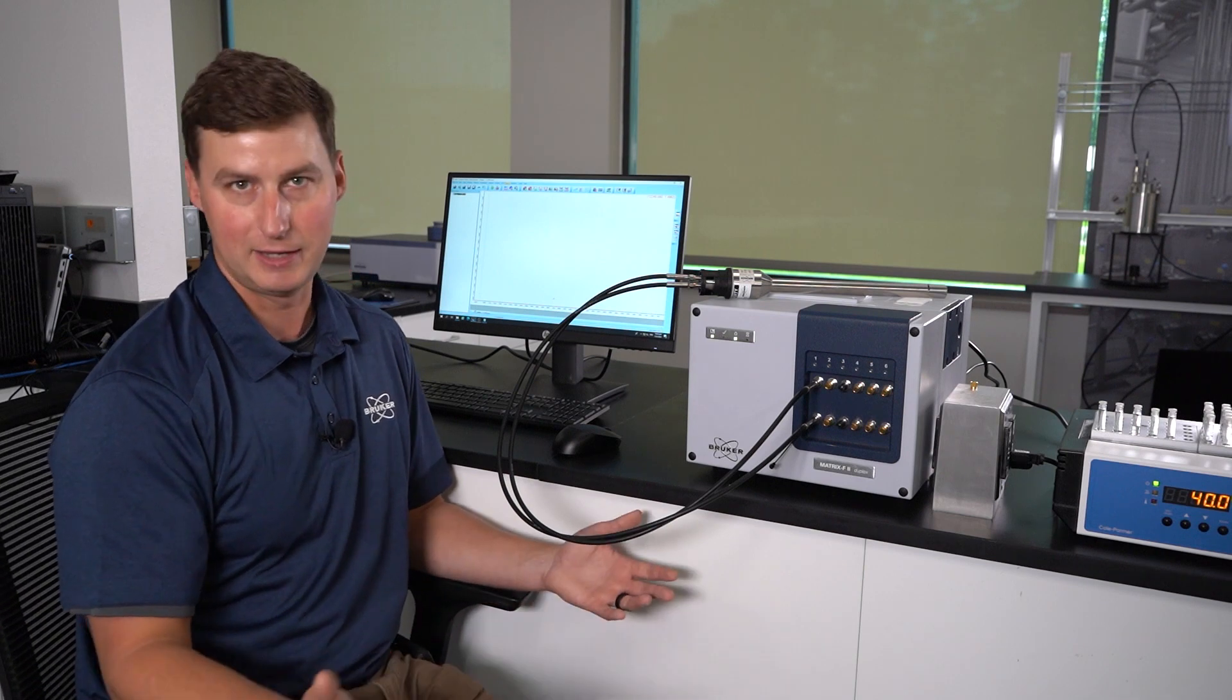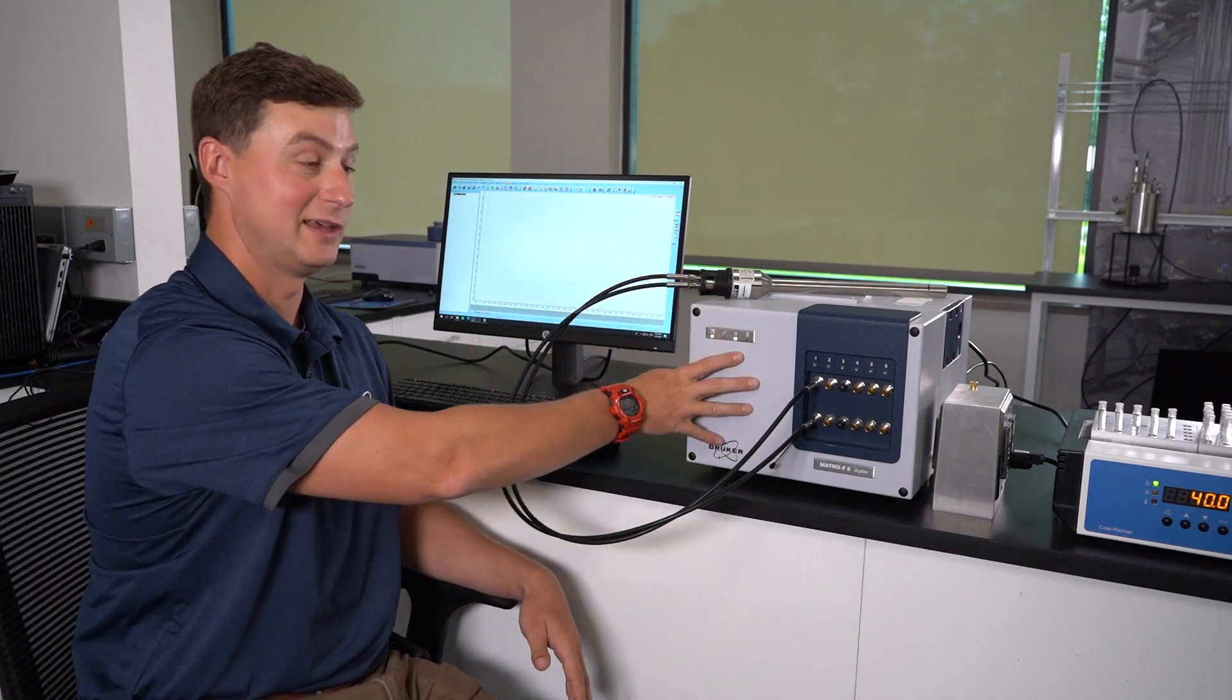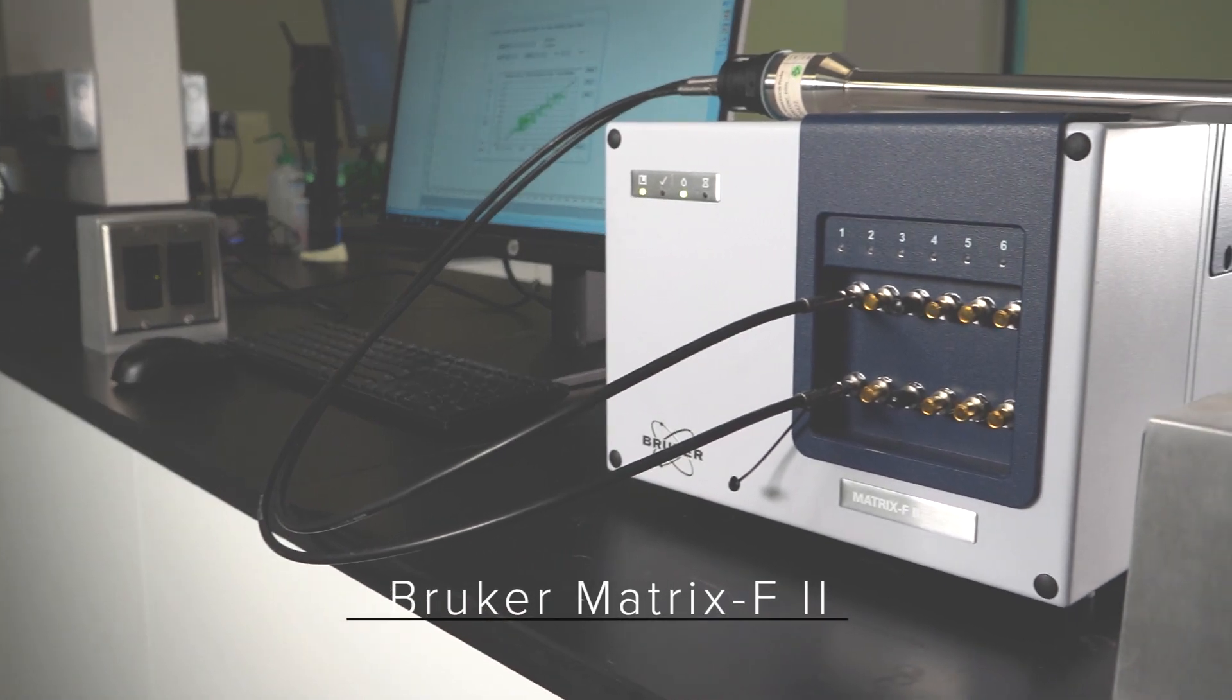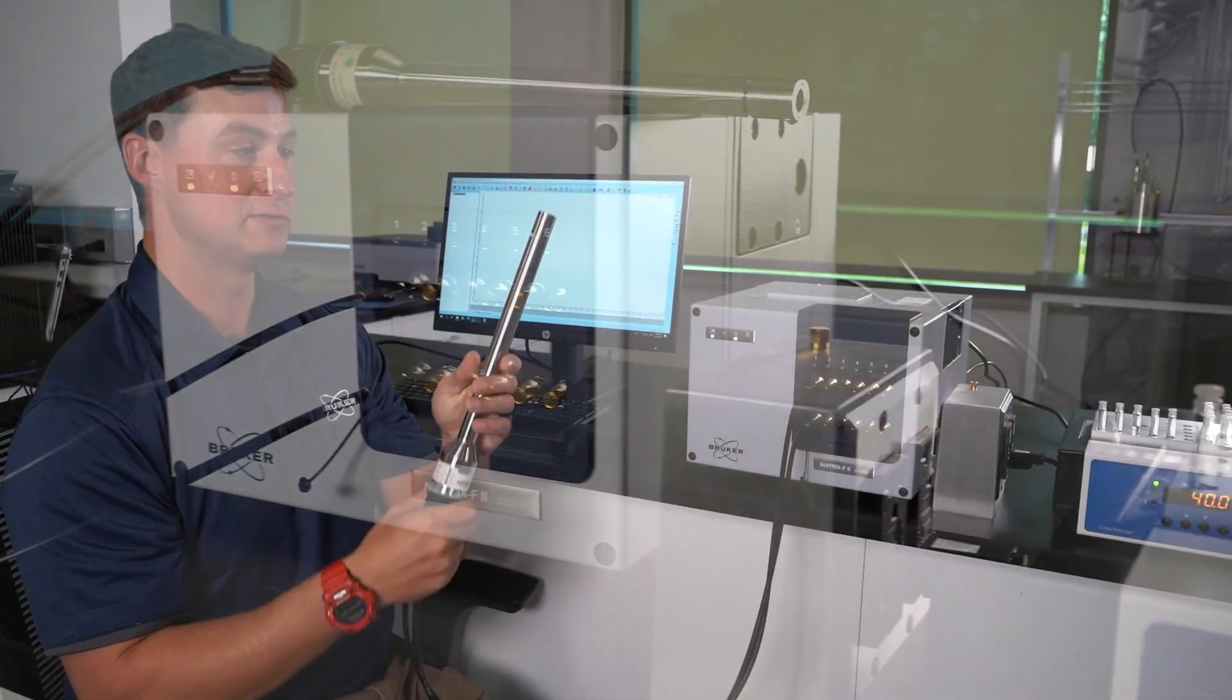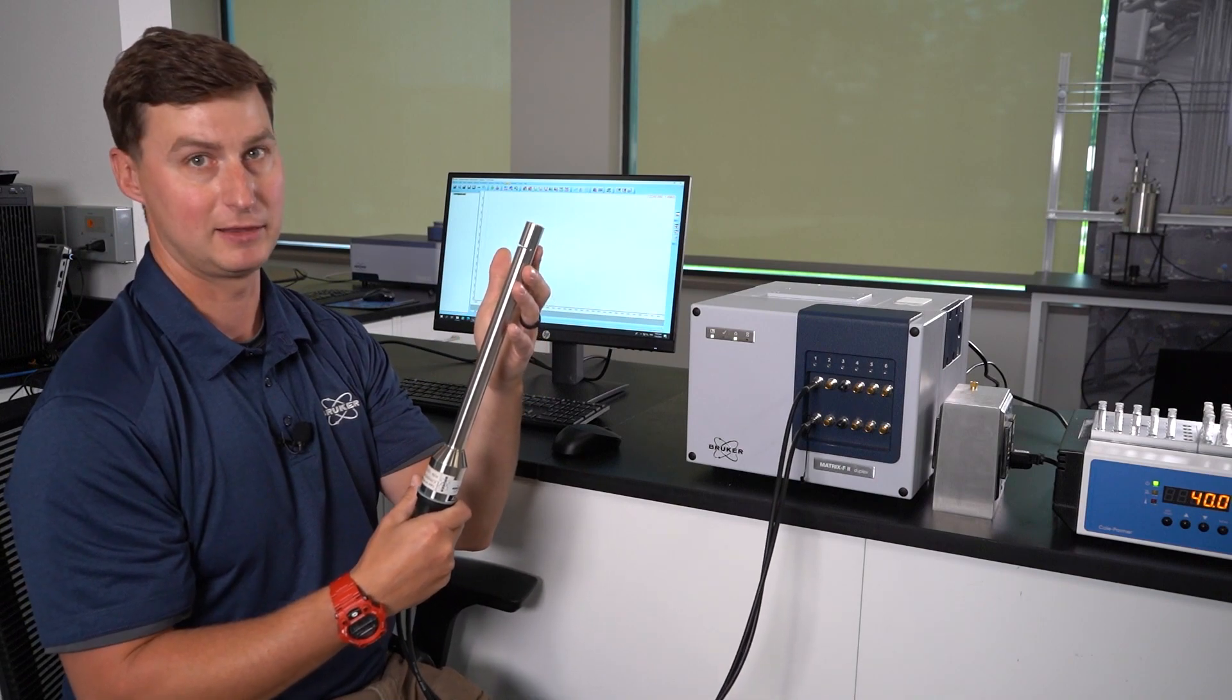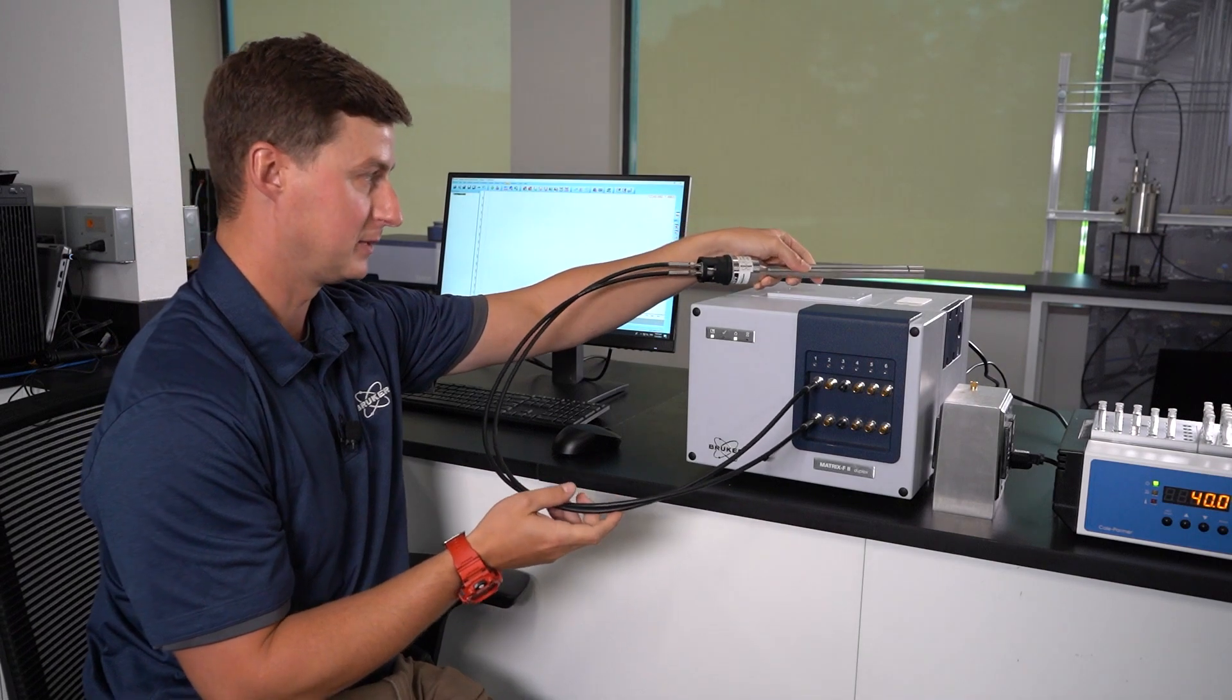Today we're going to talk about what that looks like. In this case on the bench I have set up our process analyzer, which is the Matrix F2, and it's connected to an immersion transmission probe. In this case we have a one millimeter path length transmission probe connected by one meter fiber optic cables.